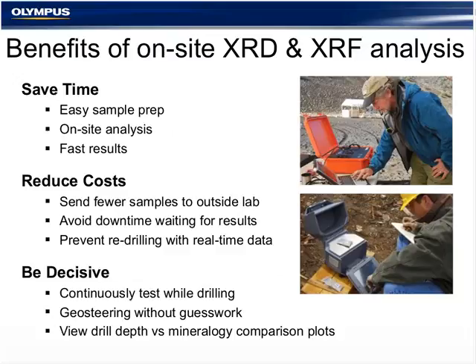The development of field-based XRD and XRF instrumentation has really, in the past few years, expanded the use of these technologies in this industry as an on-site tool. In effect, it has had a huge effect in the time it takes to get the analysis, the cost of sending samples back to the main lab, and the ability to make decisions in real time.